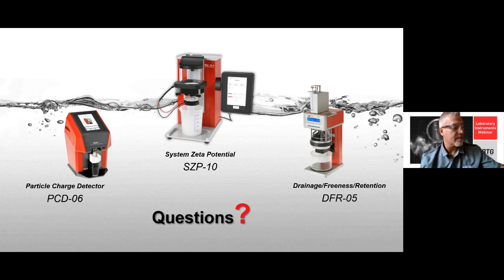A vacuum we have not available in the DFR. So what we do have is free gravimetrical dewatering, and we have press disk dewatering. The press disk dewatering you can use to simulate press dewatering systems like chamber filter presses or screw presses. But indeed, there is no vacuum coming with the DFR.